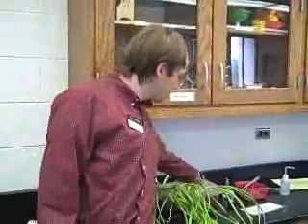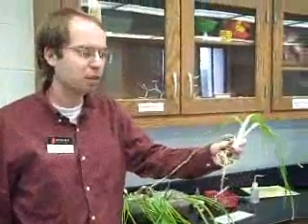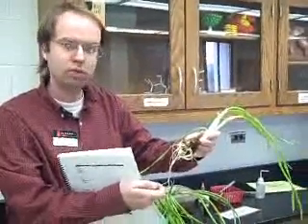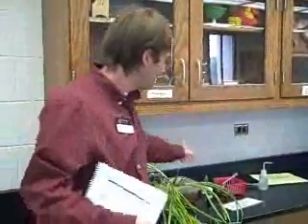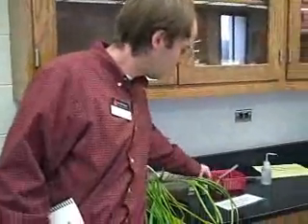For our last experiment, what we did was we made our own slide. We were trying to make a slide of mitosis in narcissus flowers. So this is a narcissus bulb, and we clipped off the end of the root. We soaked it in hydrochloric acid to soften up the cell walls. And we stained it with acetocarmine dye, which will stain the nuclei and the chromosomes red. Put the cover slip on the slide, and we just squished it with our thumb to make it flat and spread out the cells a little bit so you can see them more easily.